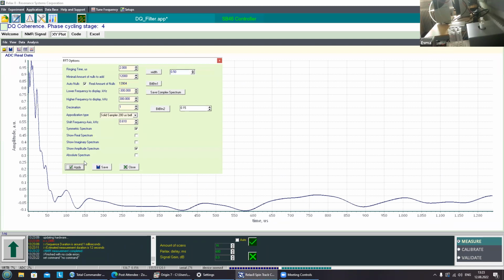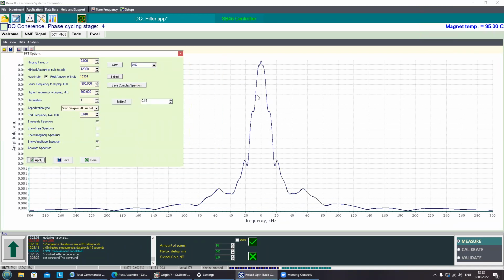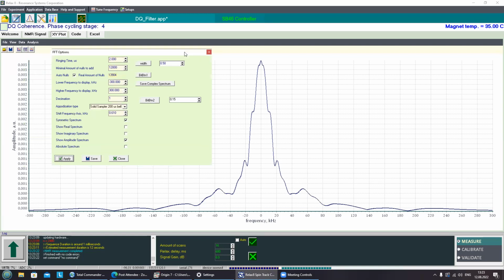And obtain the spectra. You can notice that the signal decays for a longer time, and we are catching just a very small tail of the FID, and then we observe signals. We get a really narrow line. These oscillations, of course, can be much smaller if we apply more scans. You can see that we don't see any doublet, don't see any crystalline contribution.